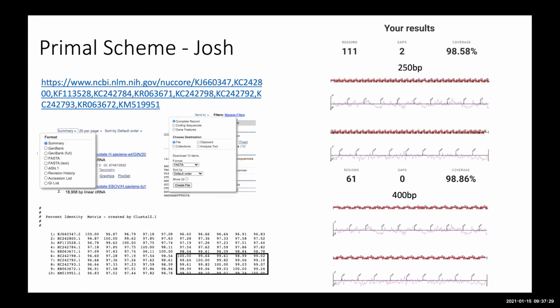You should have found the Clustal Omega alignment tool, multiple sequence alignment tool, just by searching for it on Google. And it's very simple to paste that file in or upload that file from your laptop, and make sure you choose that you've got nucleotide sequences and not amino acid sequences. And clicking on the results and looking at the percent identity matrix file, you would get a distance matrix like the one shown here. That's showing you the pairwise distances between sequences. On the diagonal, you're comparing each sequence to itself, so that will be 100%.